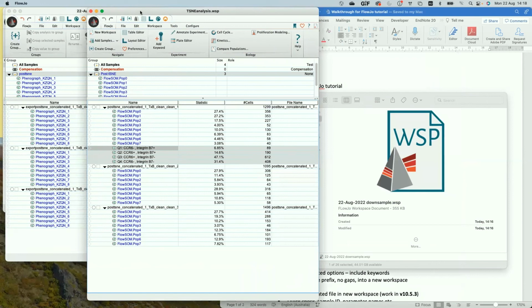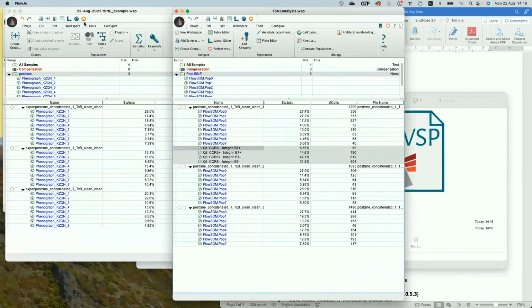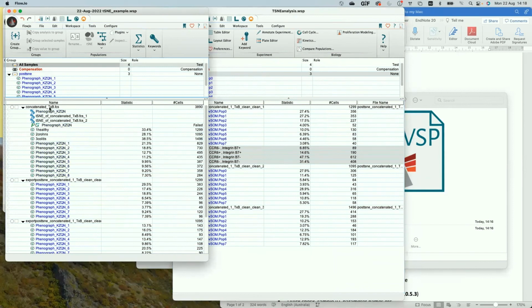Something that I was looking at is the way you do the discovery and then go back and define the gating strategy, as you mentioned. I have thought in the past to use high dimensionality reduction algorithms and clustering to define gating strategies that I'm not aware of. So if I have a sample that has been stained with 12 colors and I don't see a clear two-dimensional hierarchy that gives me a nice resolution of populations that I know and are clearly distinct, I thought, well, maybe I should do the analysis of clusters and then go back and find the gatings.